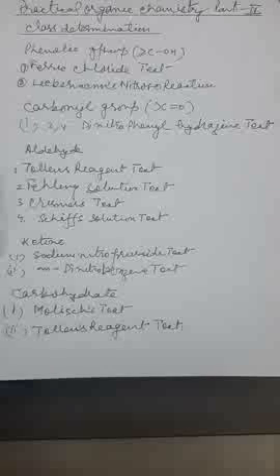The second test is the Liebermann nitroso reaction. Fuse the compound with a crystal of NaNO2 in a test tube. Cool the contents and add 1 ml of concentrated H2SO4. A dark green to blue solution is formed which turns red when poured into water.